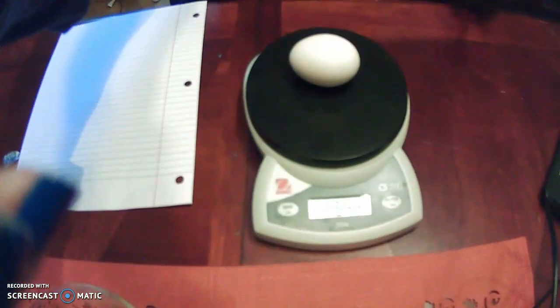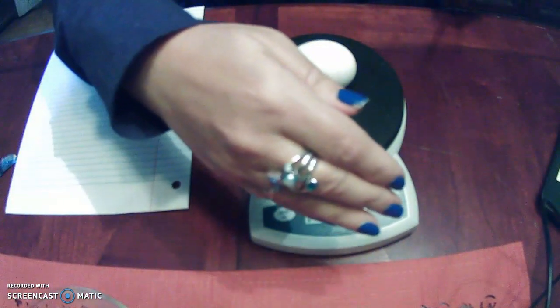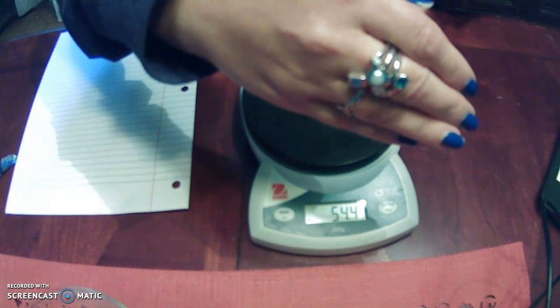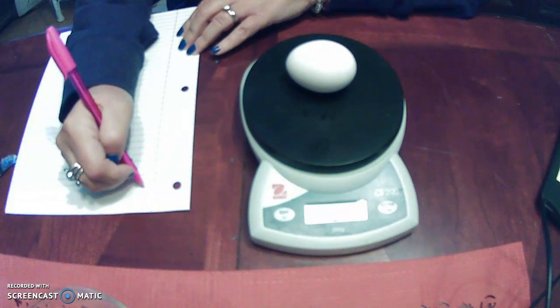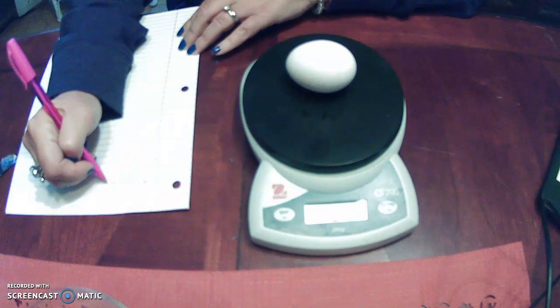Maybe you can't see with the lighting. A little bit of glare happening here. See, 54.4. Okay? I'm going to write that down. That's in grams. That was the weight of our egg.